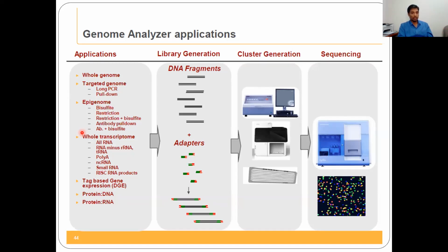So maybe it got silenced due to some error. If you want to understand whether epigenetic modifications are also there, there are some ways: you can pull down those modified areas and then sequence them. And whole transcriptome sequencing. So these are all genome.